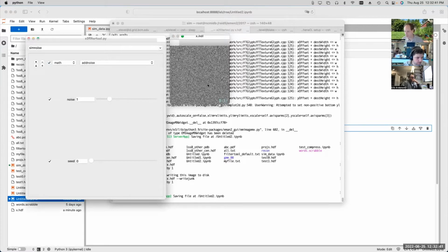Now I want to make this noise textured. Right now, this is exactly what the maximum likelihood mathematicians assumed in their derivation. This is flat band random noise. No pixel value is correlated with any other pixel value. It's basically a Gaussian distribution of values in real space, independent in every pixel. Okay, so now we add texture to it.